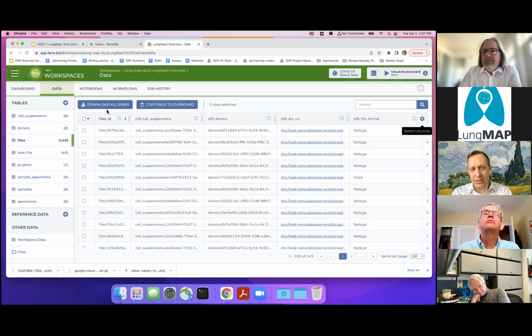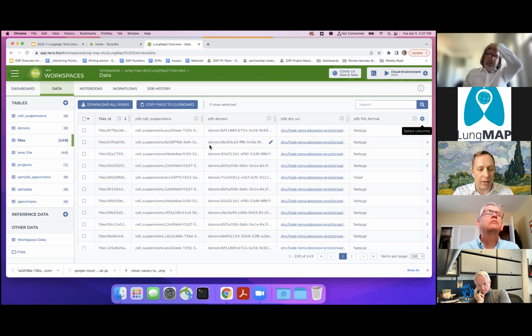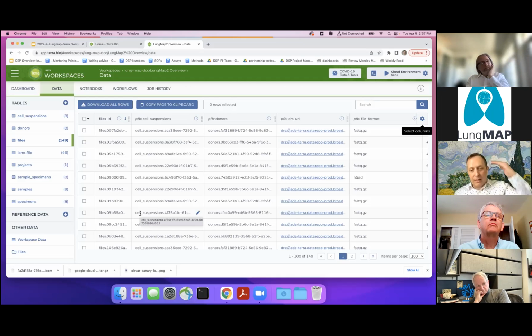That being said, you can also just download this metadata and use it however you want to use it. We're not locking you in here, all right? But nonetheless, these are really useful because we use them, as Dave mentioned, to programmatically interact with and to leverage in analysis, for instance, because this is a great data table to be able to do analysis in a notebook. Or for instance, if I set this up the right way, I can set it up so each of the rows is a different run, and then I can run a whole bunch of data through a workflow. And that's actually how we do it when we're running thousands of workflows over data sets. We literally use these data tables and we make sure they're all lined up, and then we say run them all, right? So it works in a lot of ways.